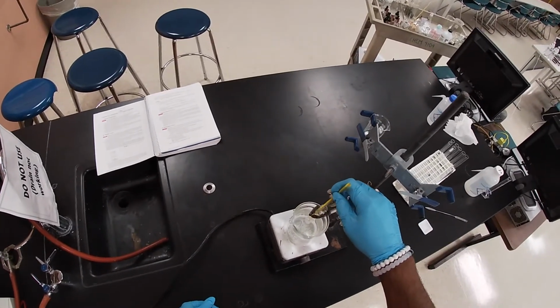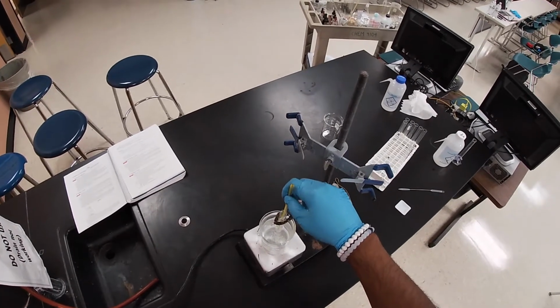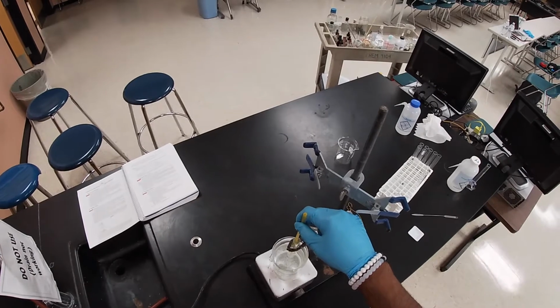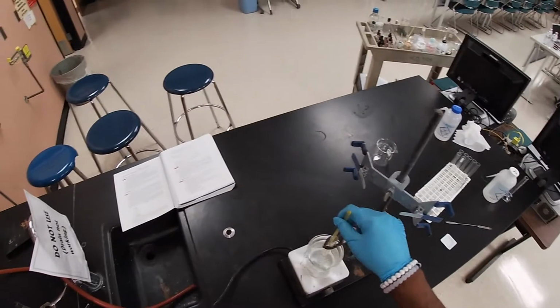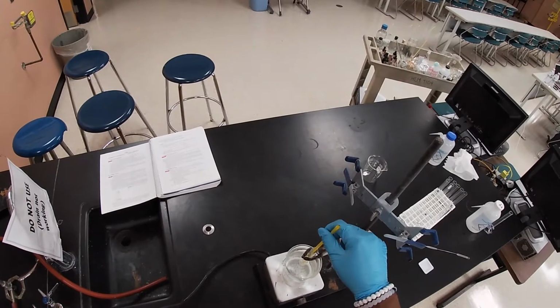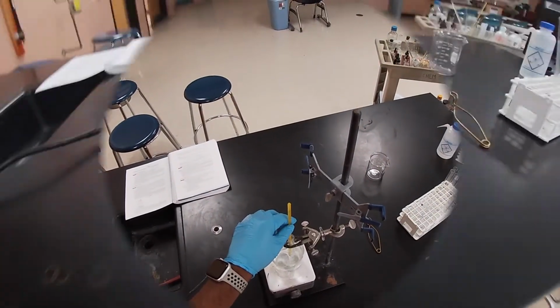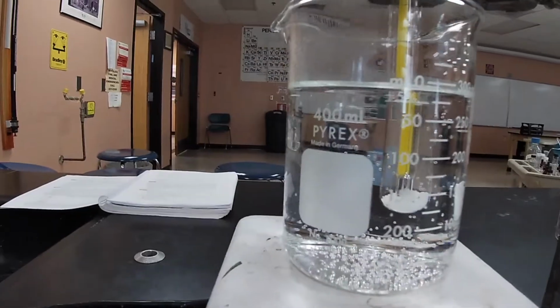Okay. So once I see that it all dissolves, I gotta remove it from the heat and allow it to cool down, and as soon as I start seeing crystal formation, I gotta record the temperature. Now you gotta be careful trying to pull the thermometer out while it's crystallizing, because we might break it. So what I have to do next is put it back in the heat so that it heats up, and once it dissolves, remove it. Okay, so I'm going to continue doing this until it dissolves, and then we'll come back. So I'll give you a different view of what I'm actually doing here.